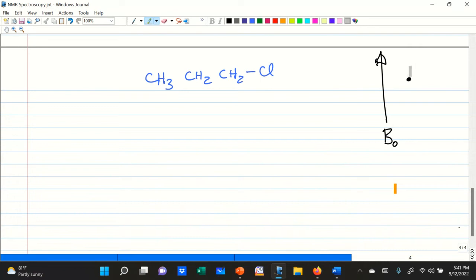As you well know, surrounding a nucleus we have an electron cloud, right? So here you have an electron cloud that is negatively charged, while the nucleus is positively charged. That is also a charged field, right?